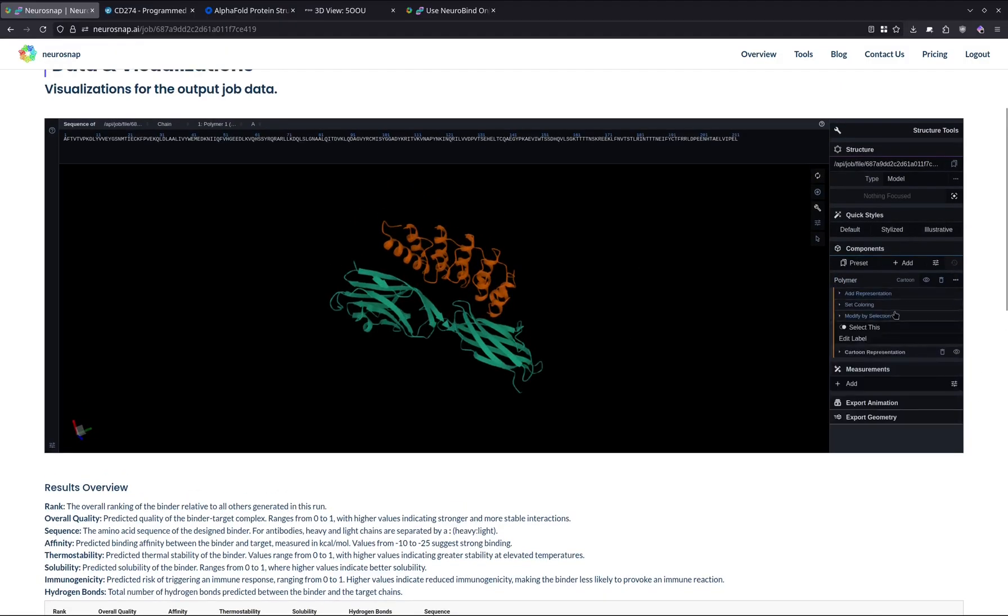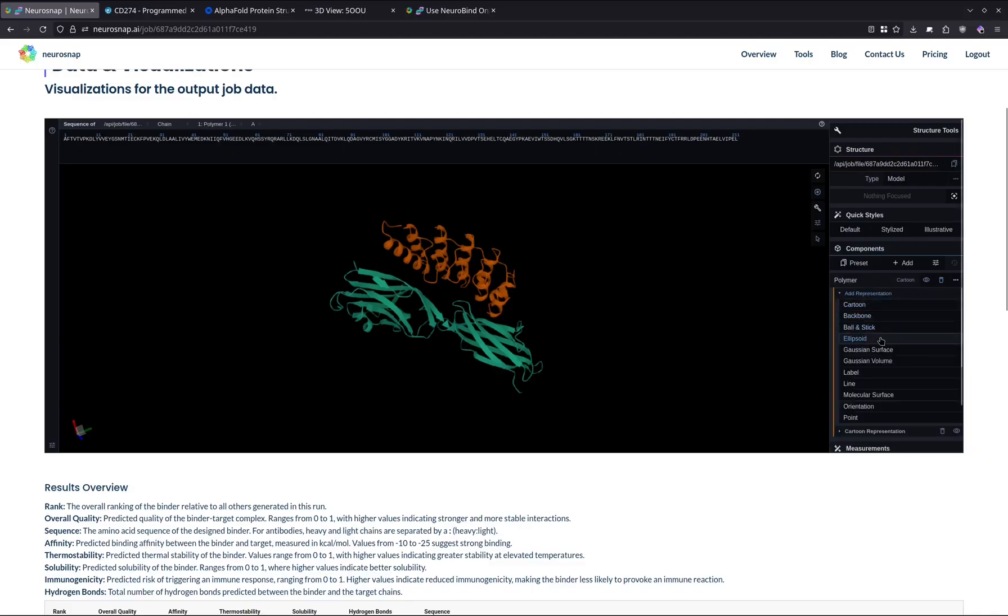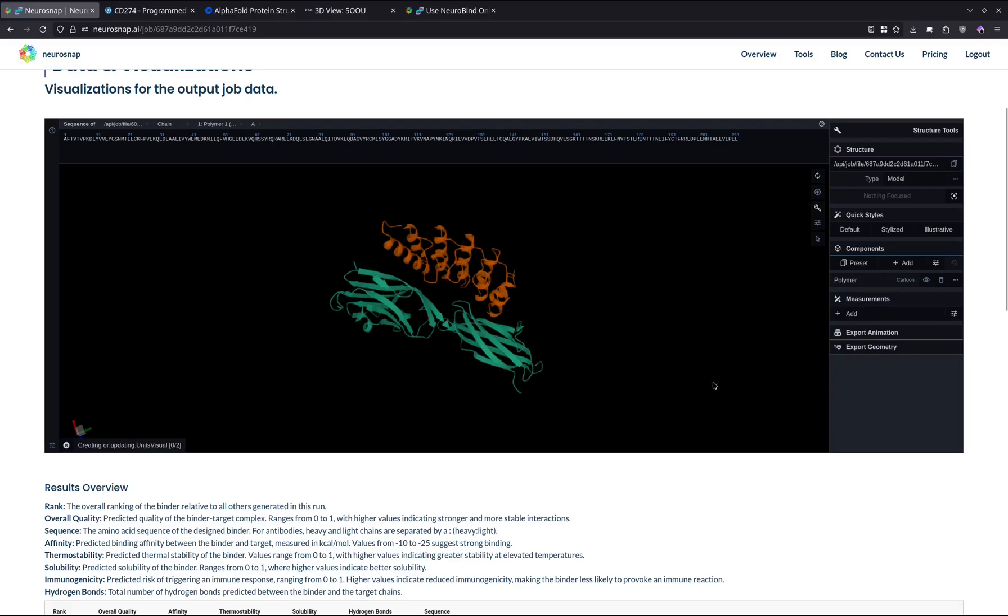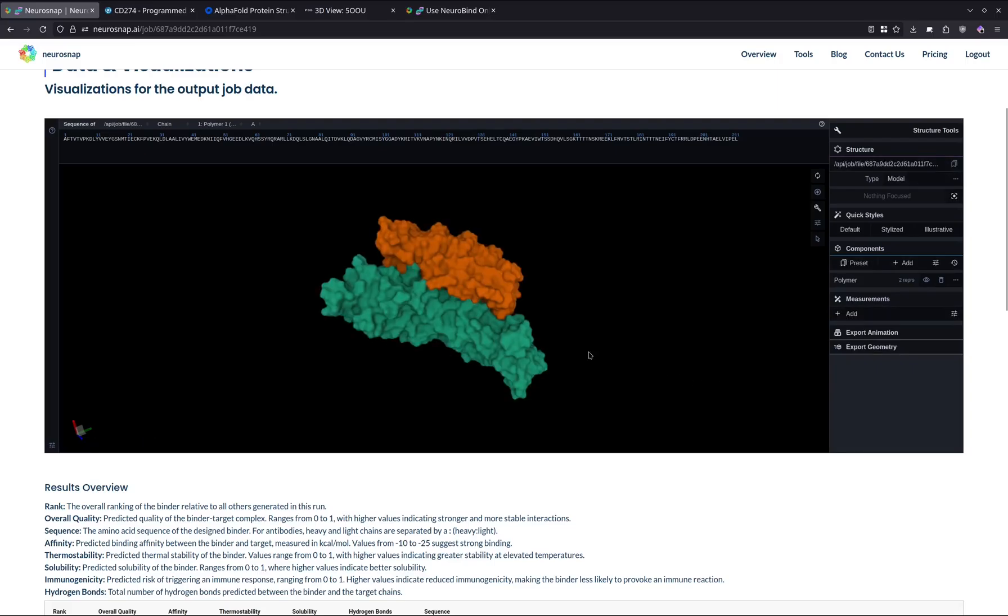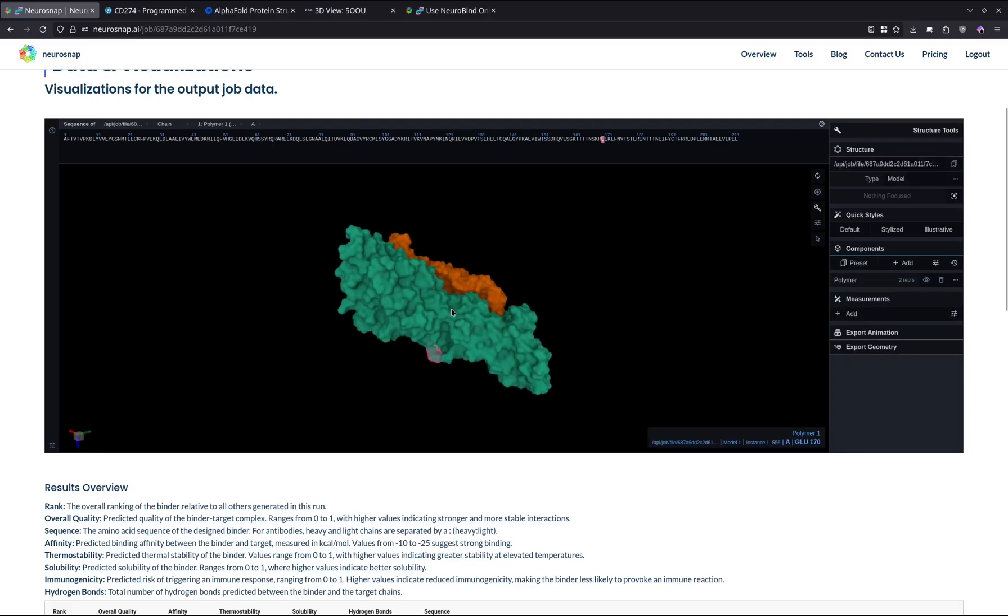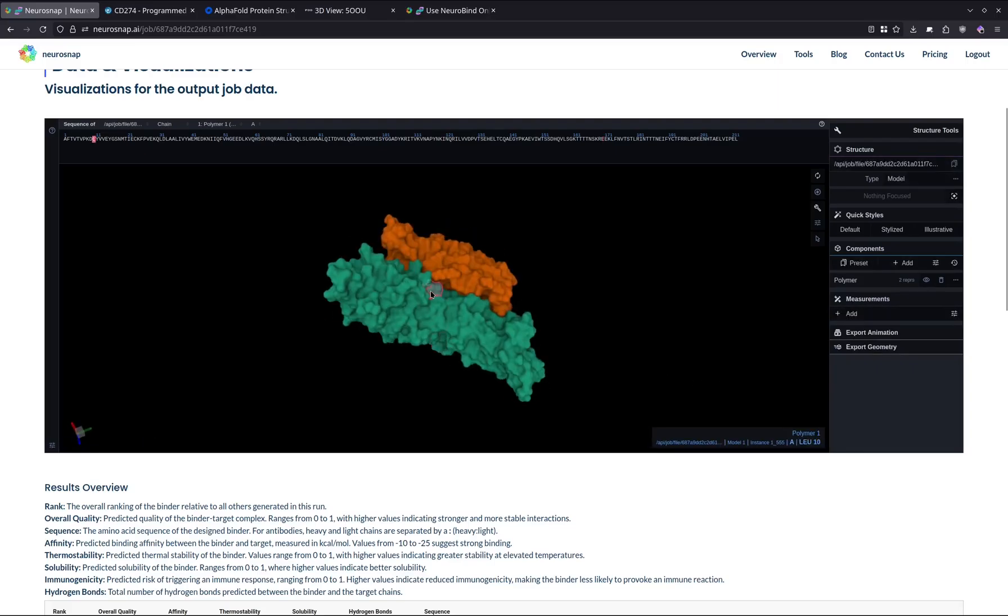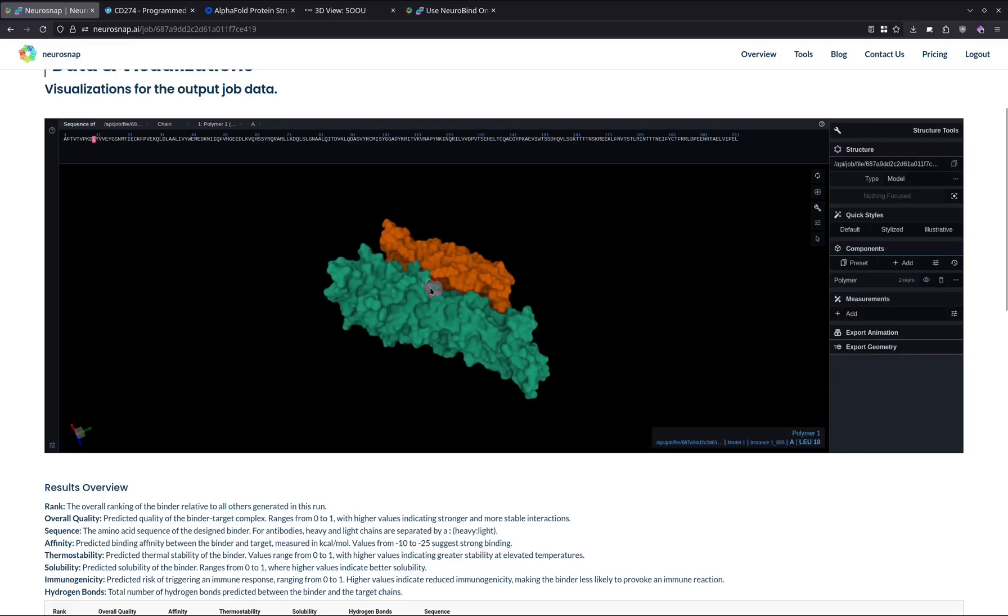Moreover, we have various options for visualizing and changing the representation. This is a cartoon representation, but if you want to switch over to the molecular surface, then we can just select that button and we can actually access that directly.